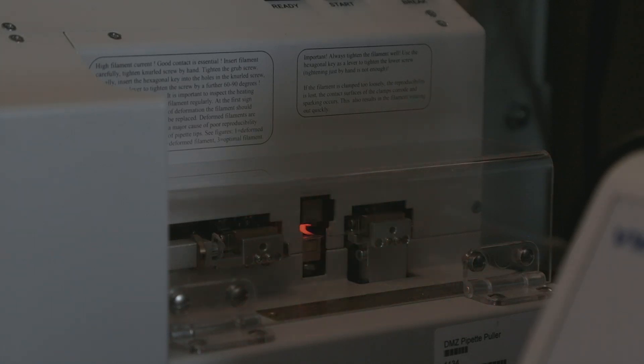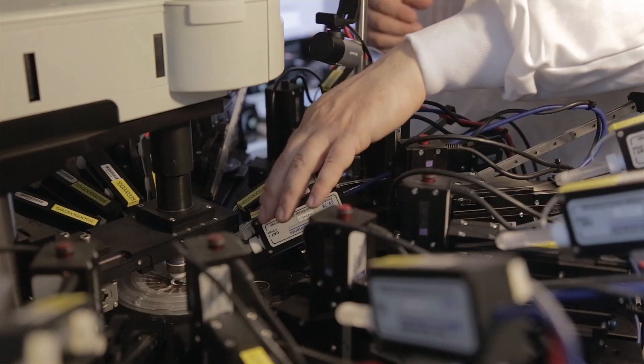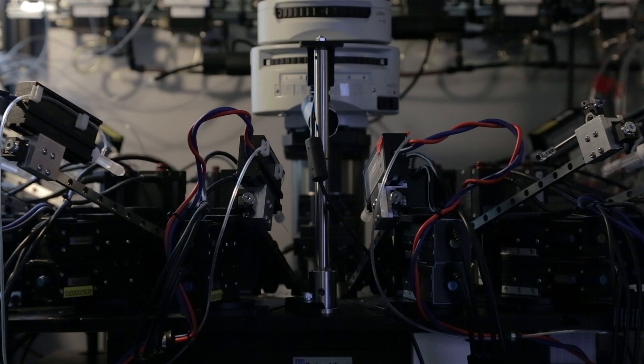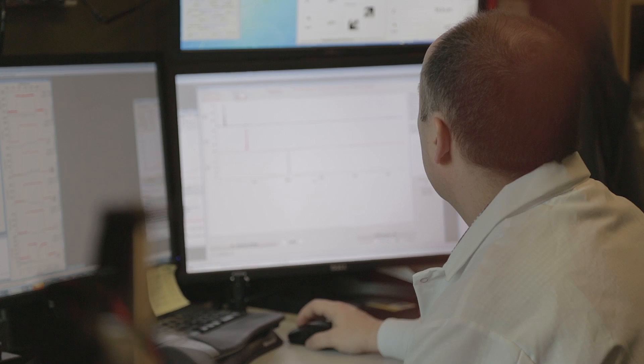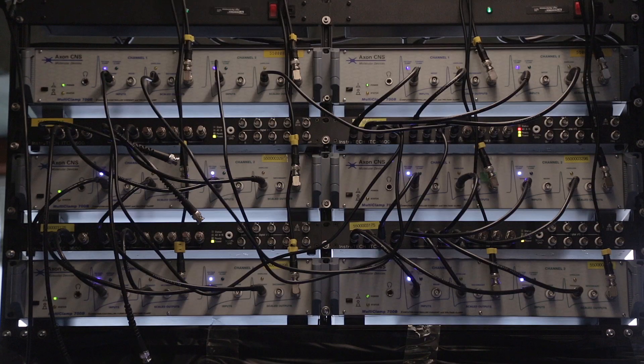To get these recordings, you need to physically place the tip of a glass pipette onto a neuron with submicron precision, and typically that's done with devices called micromanipulators. You could divide a rig up into maybe three or four major components: your optical tools that allow you to see the cell, your manipulators that allow you to place those electrodes onto the cells, and your digitizing and amplifying tools that allow you to record and process the signals from those neurons.